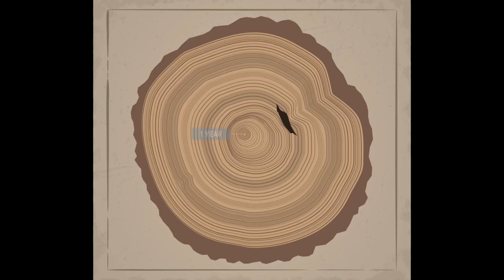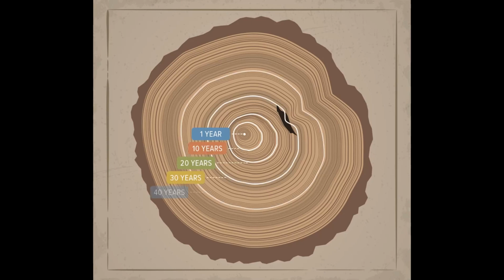Do you want to build a tree-ring chronology, but you don't know how? Here, I'll show you how to accomplish this.